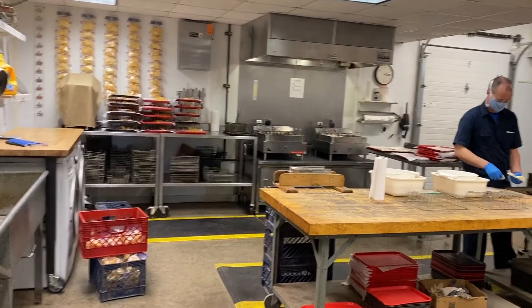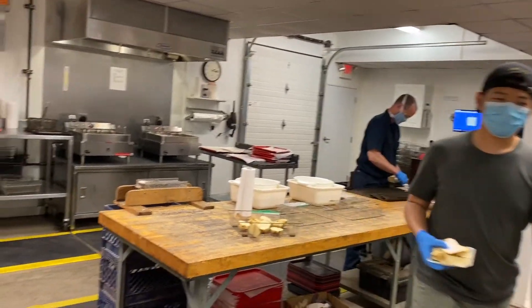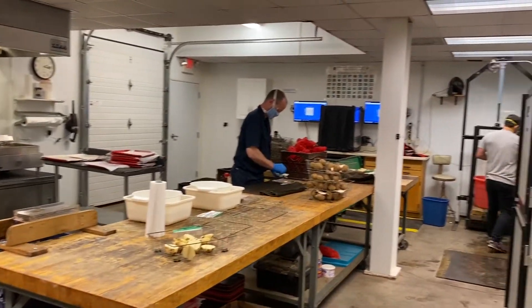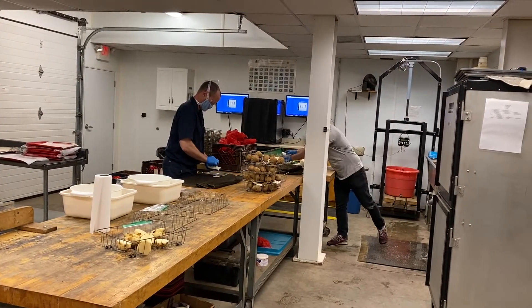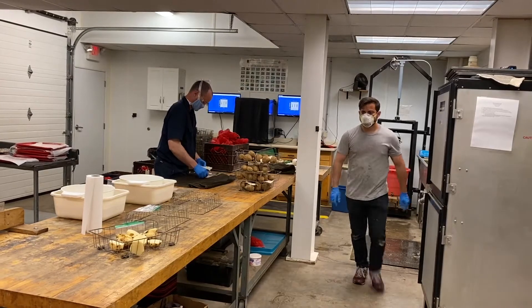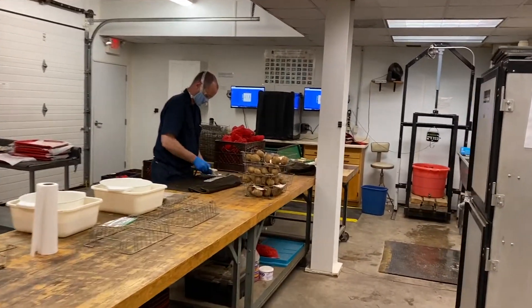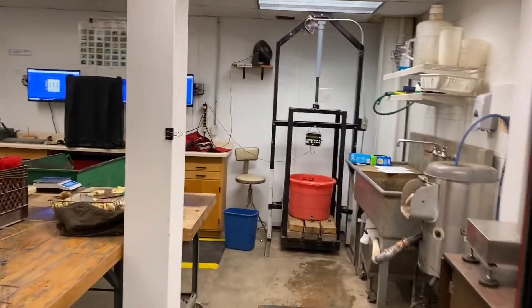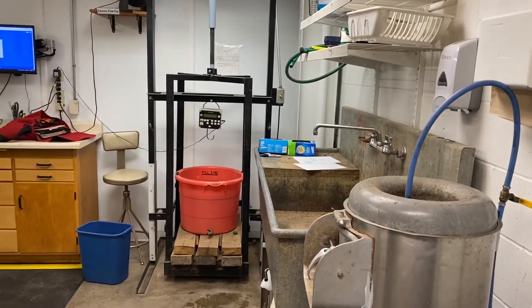So I am in the processing lab right now. We can see that people are busy with their work. In this part of the lab, we have three positions. Each one represents a step of the processing of potato chips.